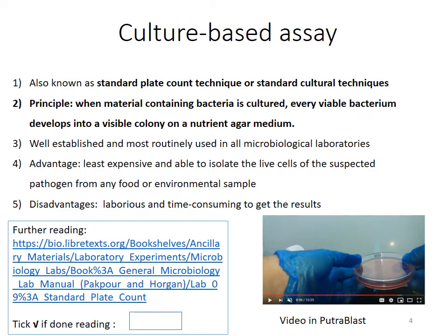The culture-based assay is also known as the standard plate count technique or standard cultural techniques, or sometimes we just say the culture method. The principle is that when you have a material contaminated with bacteria and you culture it in the lab, the viable bacterium develops into a visible colony on the nutrient agar medium, as you can see in the figure here. It is a well-established method and mostly used in microbiological labs.